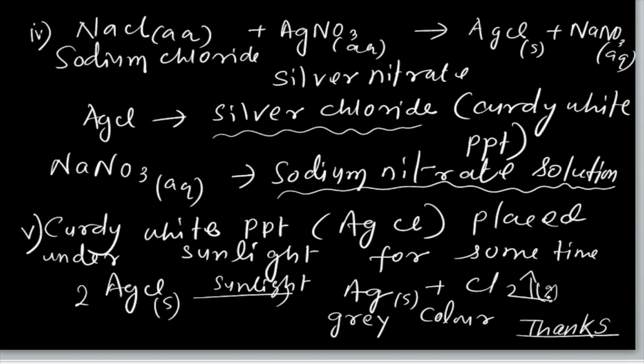This is activity 5, where you can see the carbon dioxide gas, and how you can know it is carbon dioxide by passing it through lime water. Similarly, what happens when silver nitrate solution is added to sodium chloride? Don't add sodium chloride to silver nitrate, because silver nitrate is taken as a reagent, so you add a little of the solution to the sodium chloride aqueous solution in a test tube.